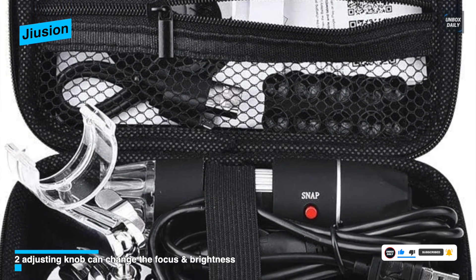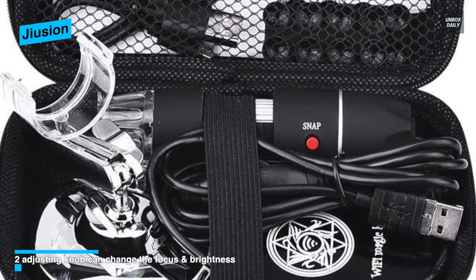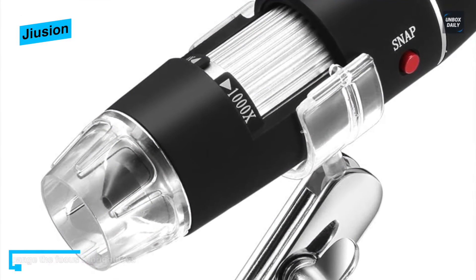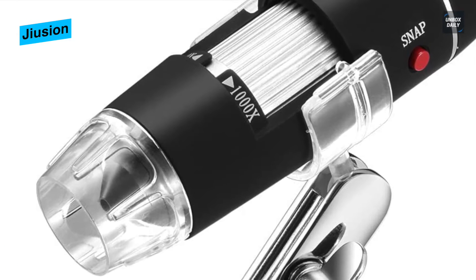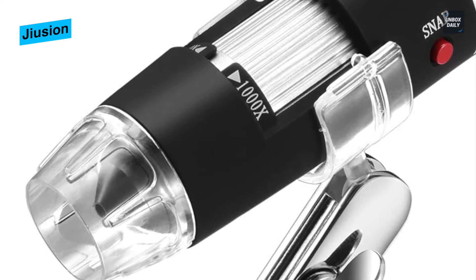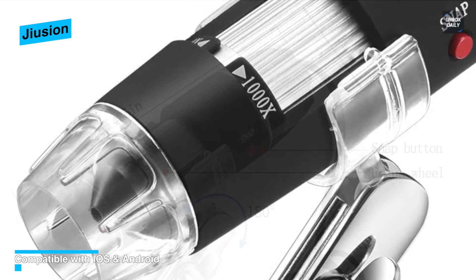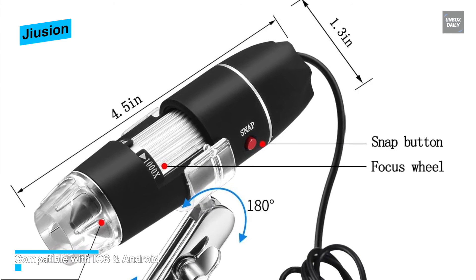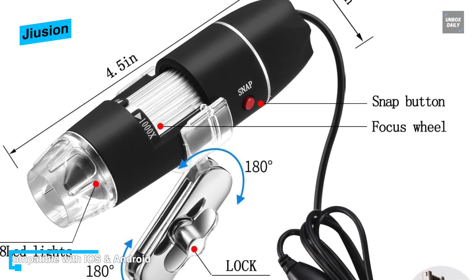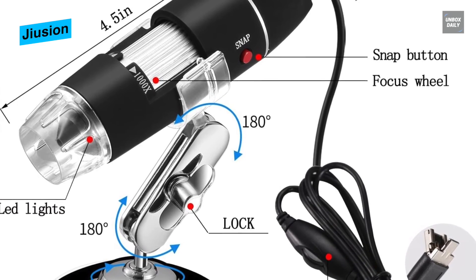The Juzhin USB Digital Microscope can record video at up to 30 frames per second, which is standard for most digital microscopes today. Its software is not compatible with iPhone, though Windows users can use the measurement function and Mac users can still access its best features. It has a magnification ratio of 40x to 1000x, and at just slightly above $20, it offers great functionality and portability — letting you explore the micro world without breaking the bank.